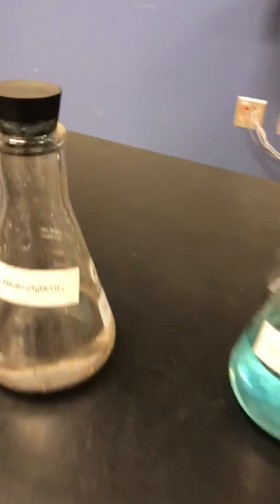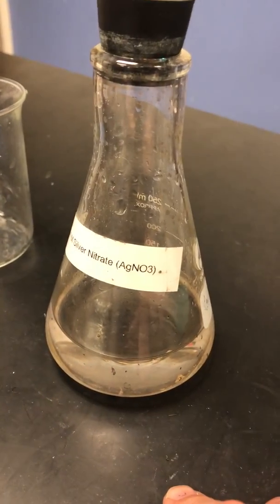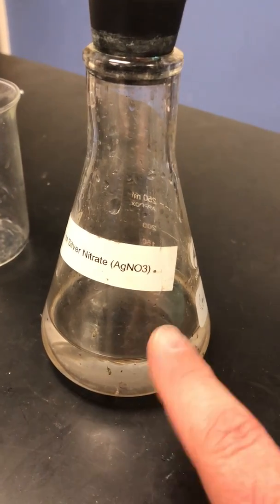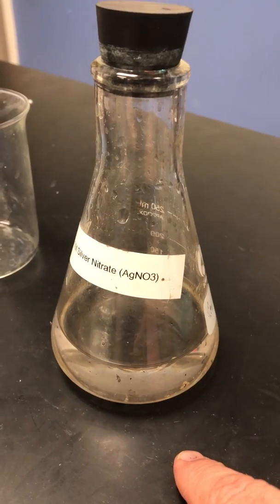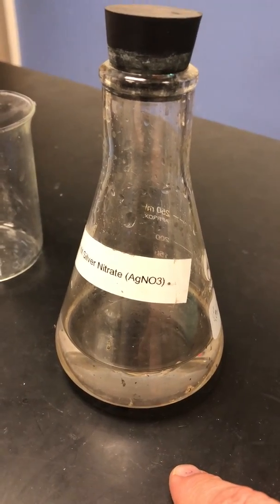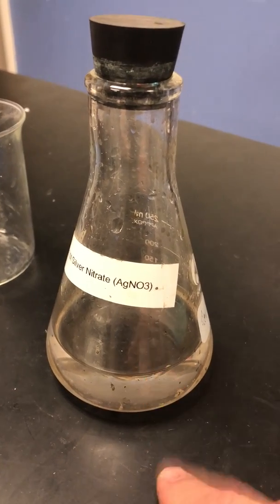Last piece, safety. Ready? AgNO3. This stuff, you can see it's starting to kind of turn in the Erlenmeyer. This will burn you. Don't get this liquid on you. It won't burn you like you know what I mean. It won't hurt. You won't feel any heat. Your skin isn't going to bubble up.